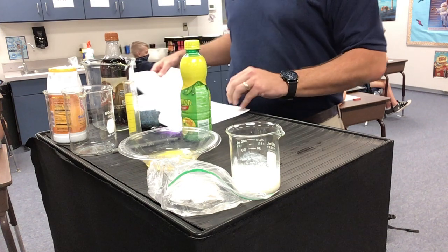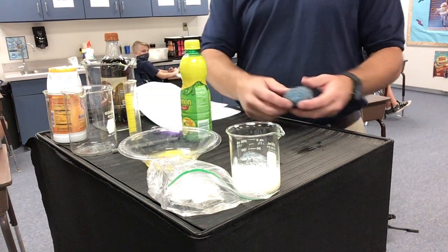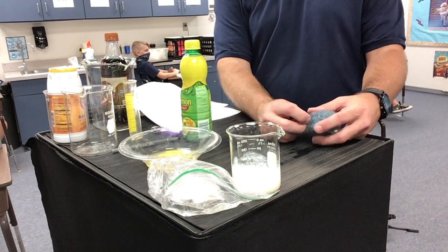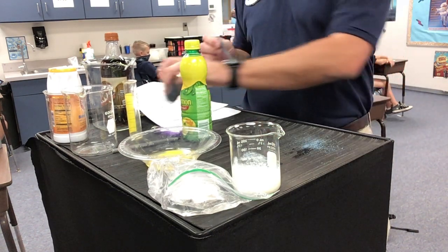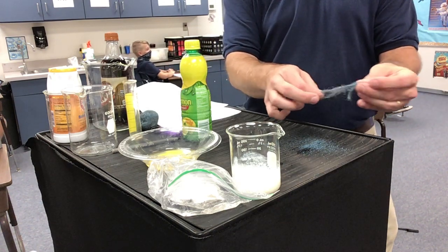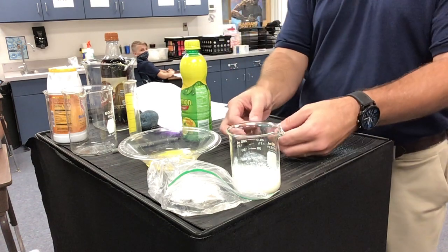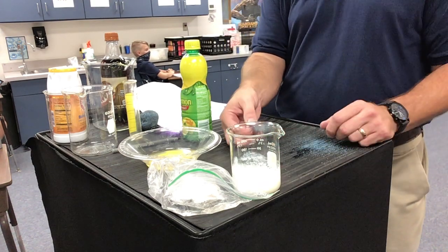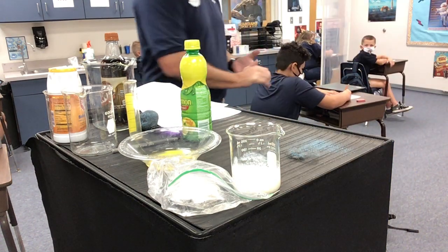Next one, taking steel wool. I have steel wool. I'm going to change it by doing this. Okay, take the steel wool, tease it apart. I've changed it.